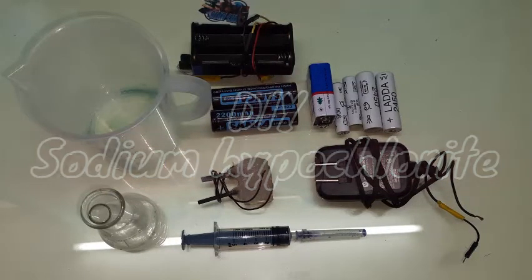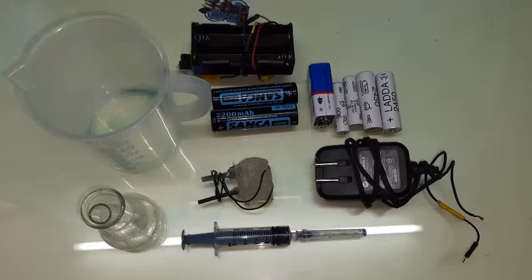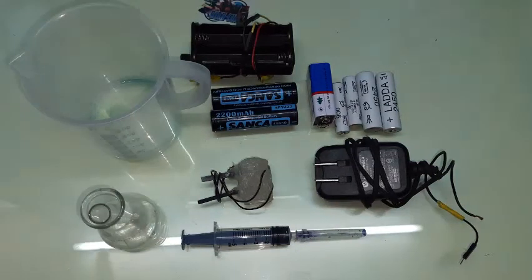Hey guys, welcome back, Techatronics here. Today we're going to make some sodium hypochlorite using simple household materials like salt, water, batteries, and some ink. It's pretty simple. You need a beaker or any fancy liquid container.